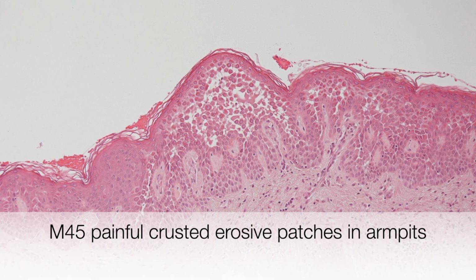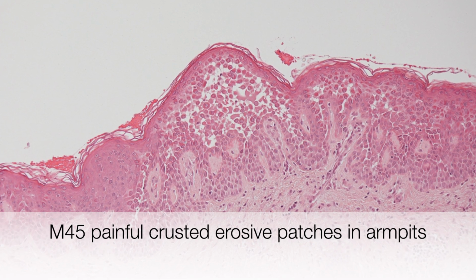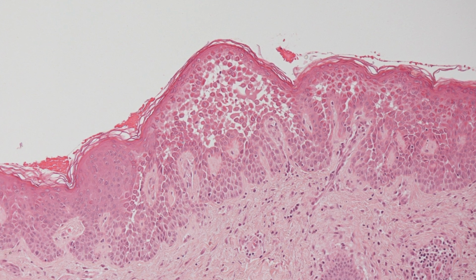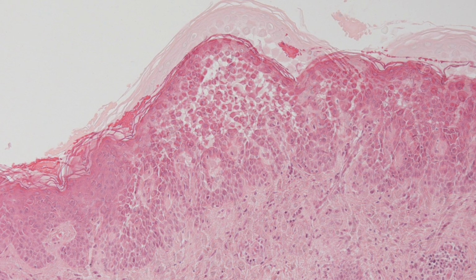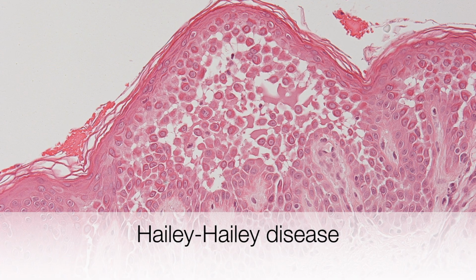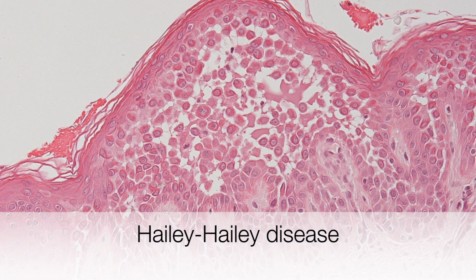The second case was a male of 45 with painful crusted erosive patches in the armpits, and this skin biopsy shows features of Hailey-Hailey disease. And the link to the video about Hailey-Hailey disease is above.